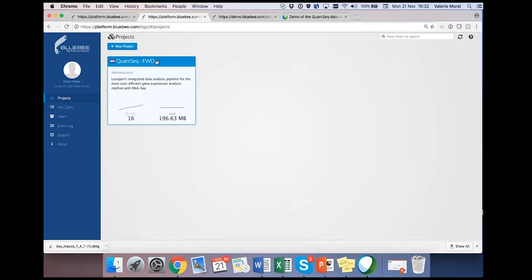So they extended the 3' UTR downstream by, I don't know, a couple of kilobases or so. The annotation was not so good there. But for mouse, human, and rat, it's so well annotated in Ensembl that you don't need extra definitions.